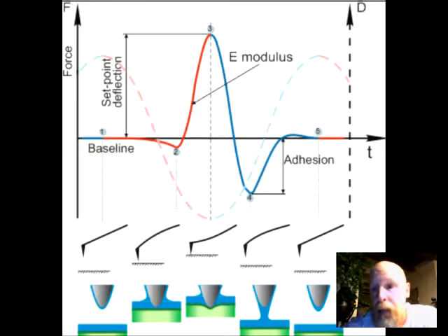In non-contact mode, and we will show you an image for that, the tip of the cantilever does not contact the sample surface at all. The cantilever is instead oscillated at either its resonant frequency, which is frequency modulation, or just above, amplitude modulation, where the amplitude of the oscillation is typically a few nanometers, less than 10 nanometers, down to a few picometers actually.